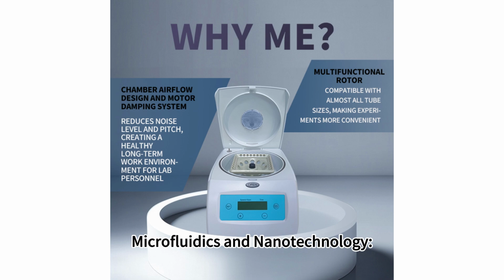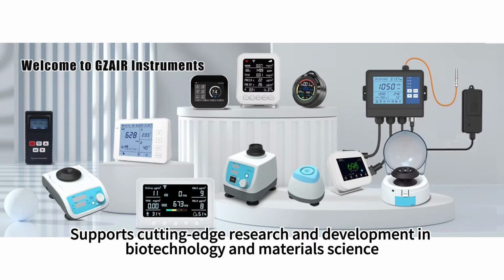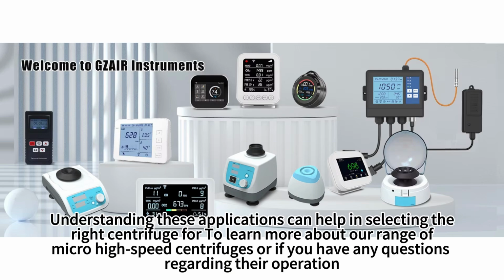Microfluidics and nanotechnology. Description: used in the preparation of nanomaterials and microscale devices. Importance: supports cutting-edge research and development in biotechnology and materials science. The typical applications of a micro-high-speed centrifuge span across various fields, including molecular biology, clinical diagnostics, and biotechnology. Understanding these applications can help in selecting the right centrifuge.